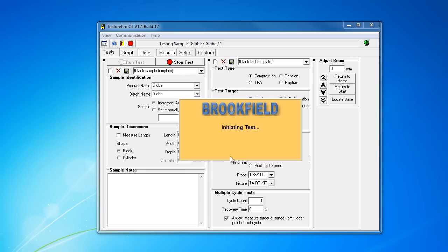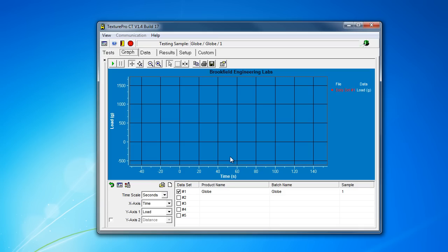The machine is going to initialize. Running multiple tests on this thing is quite the time-consuming experience. It's not quite as flexible in terms of the general setup. It likes to initialize every time. It likes to start from zero every time. You end up spending a fair amount of time just waiting for it to do its thing.